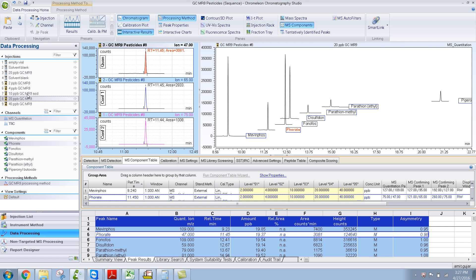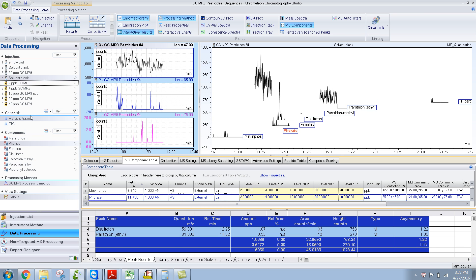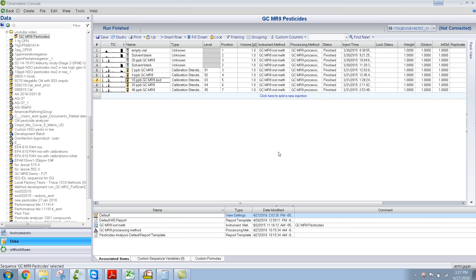That can be quite laborious sometimes, but pressing F4 is pretty quick. Let me warn you about something though: many times instead of pressing Shift+F4 to go backwards, I've accidentally pressed Ctrl+F4 — and Ctrl+F4 closes the studio. So you have to be a bit careful. Shift+F4 goes in reverse, but Ctrl+F4 closes the studio.